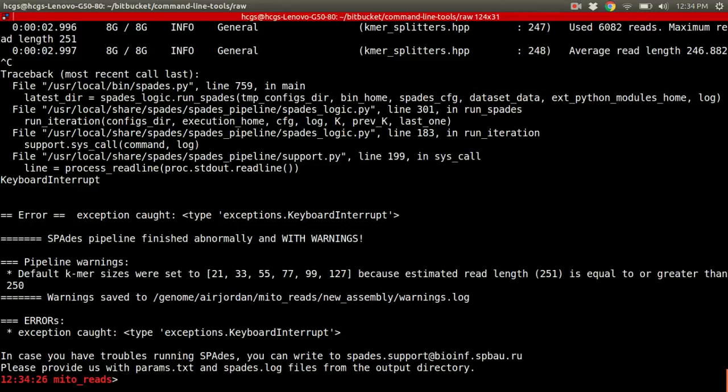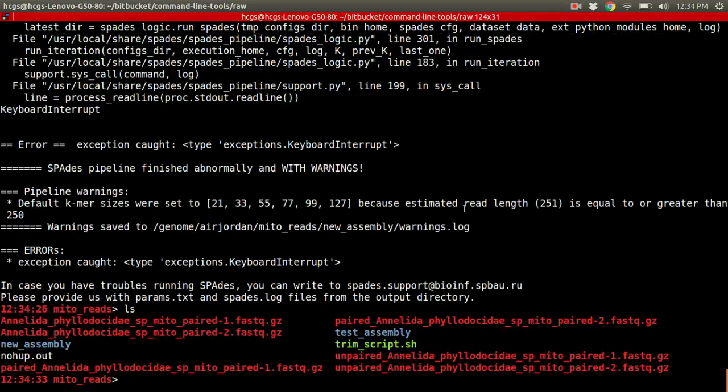I'm just interrupting this. And this is why I have this right here, the finished one. I'm sorry, yes, this one. Because then we'll be able to see it in real time. So go ahead, finish that, pause this, come back to this video, and then we'll continue.